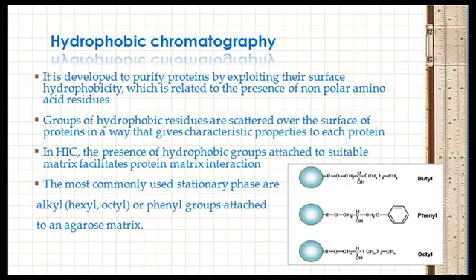Now we'll discuss hydrophobic chromatography. This type of chromatography was developed to purify proteins by exploiting their surface hydrophobicity, which is related to the presence of non-polar amino acid residues in proteins.